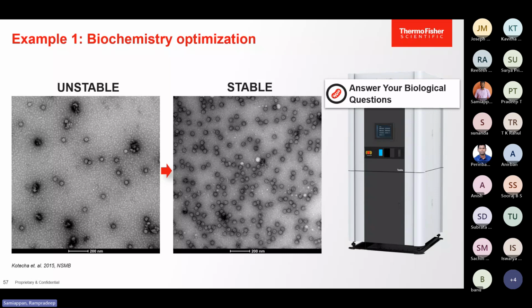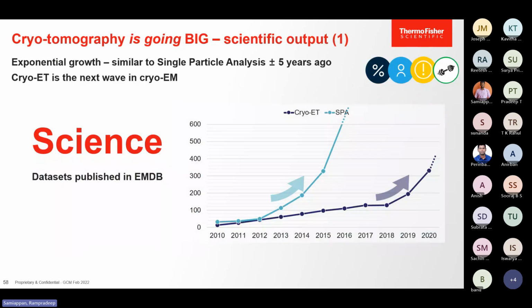Yes. So what we can do is optimize our preparation by visually seeing the particle of interest in the microscope. And once it is optimized, you can acquire good quality images, and later we can try to answer our biological questions. So the next step is I will go through the tomography process. The first part, single particle analysis, is done, and the next step will be tomography.